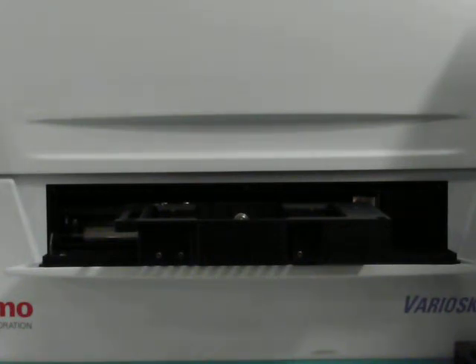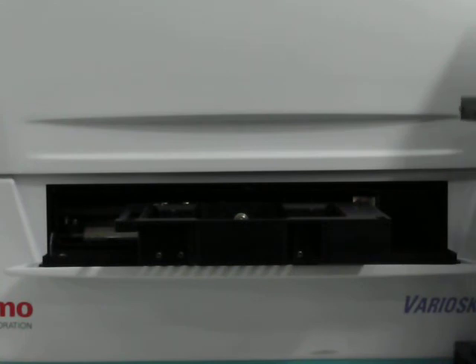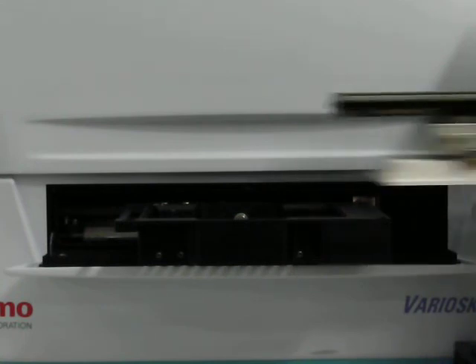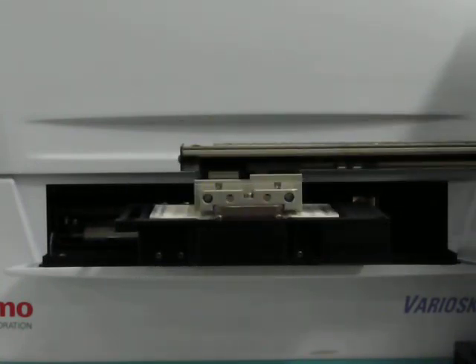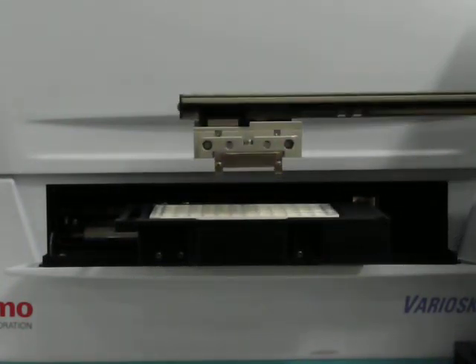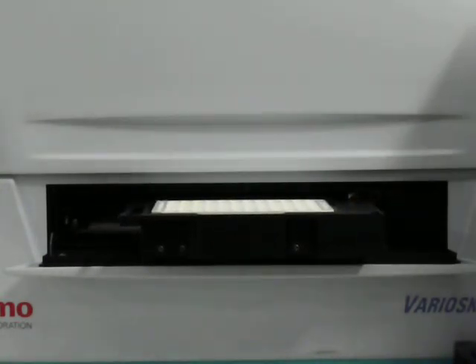It's moving back to the RapidStack, storing that plate, picking up container number 3 now, and it's going to deliver that to the nest. The VarioScan nest will enter.